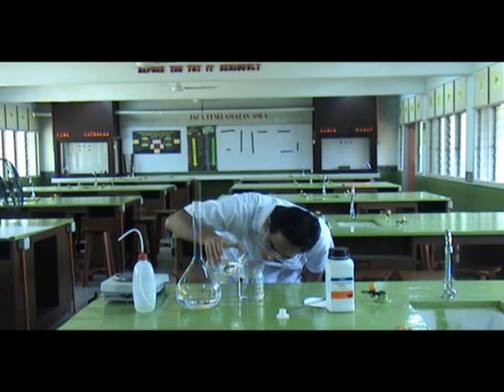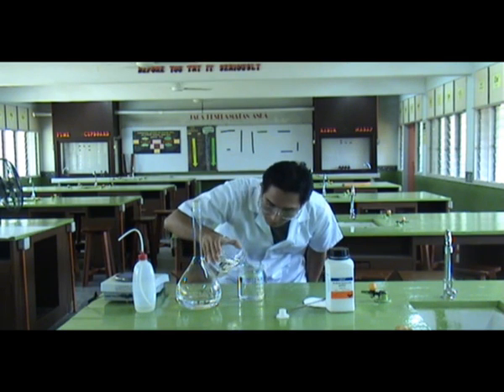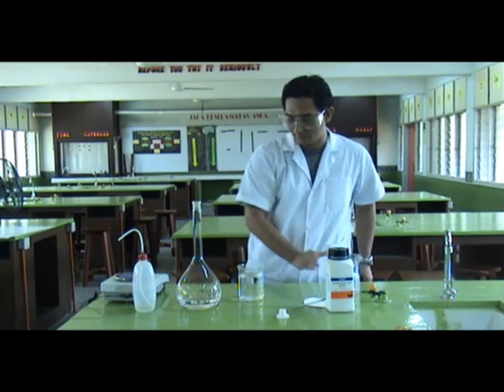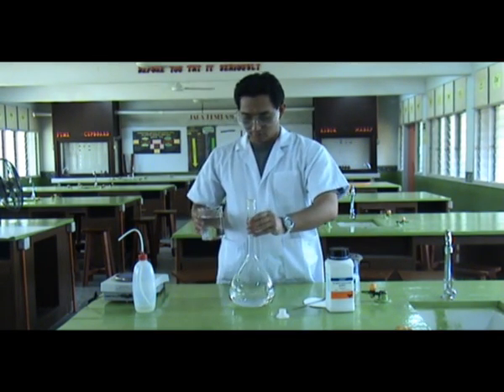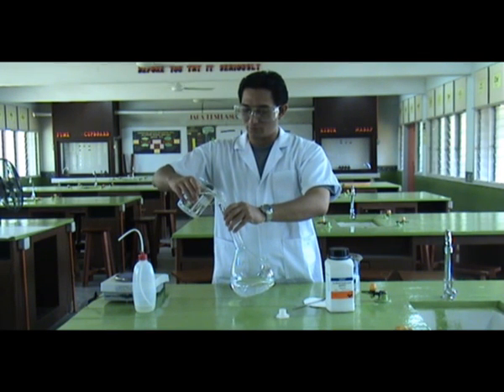Just a little bit more. We pour it gently into the volumetric flask.